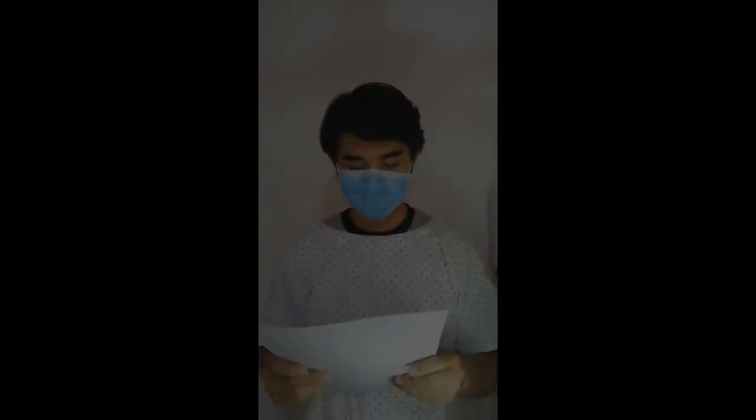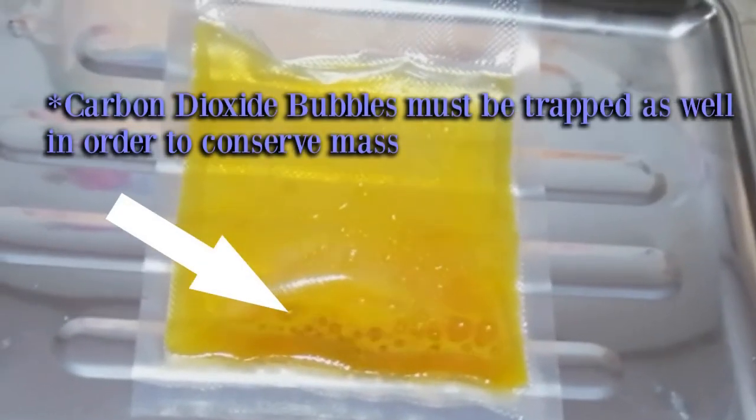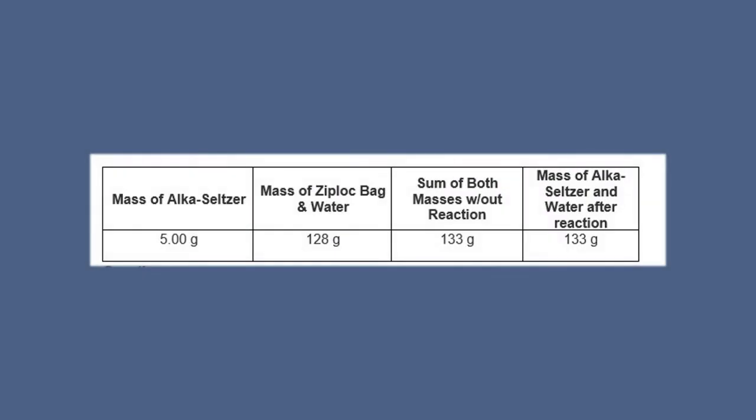Mass is also conserved in chemical changes as long as the mass was kept intact in a container. In our case, not sealing the bag will cause some of our matter to escape in the form of carbon dioxide gas, which will affect the amount of gas present in the sample.